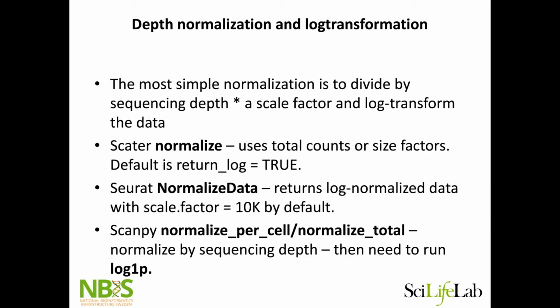The same for Seurat's NormalizeData. It log transforms and normalizes in one step. In ScanPy, it's two separate functions for normalization and log transformation.